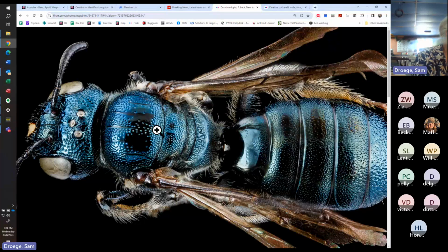Yeah, cool. I'm not seeing anything that helps with ID, but who knows what else is going to show up. I wonder if cockerelli has them. So smooth. Maybe yes, but very faint.